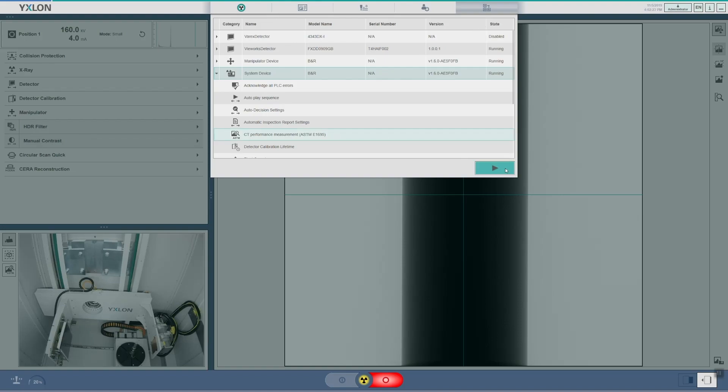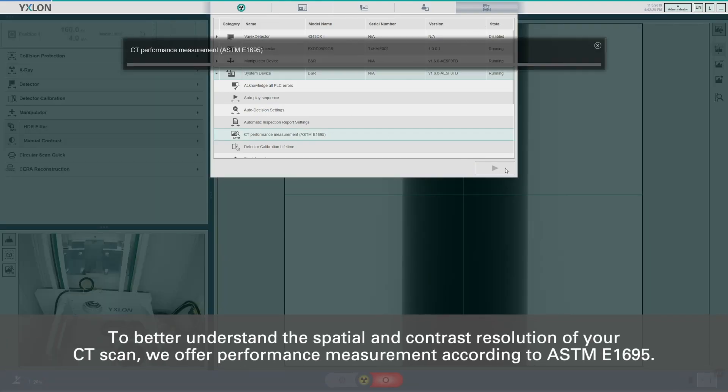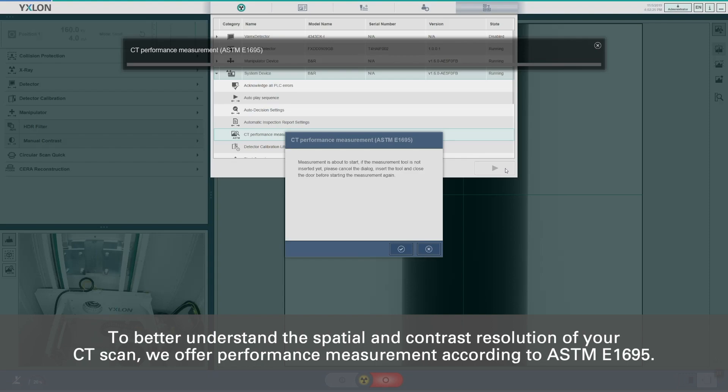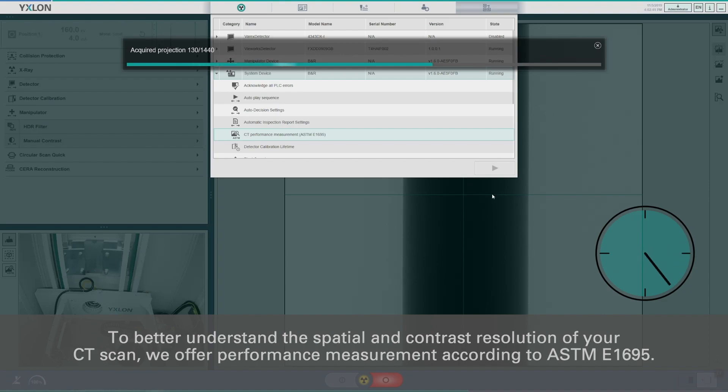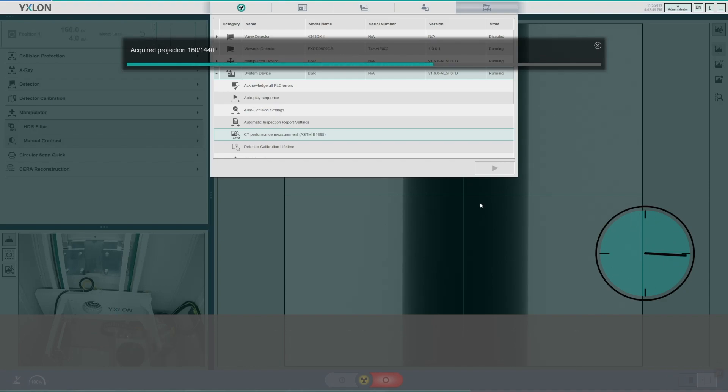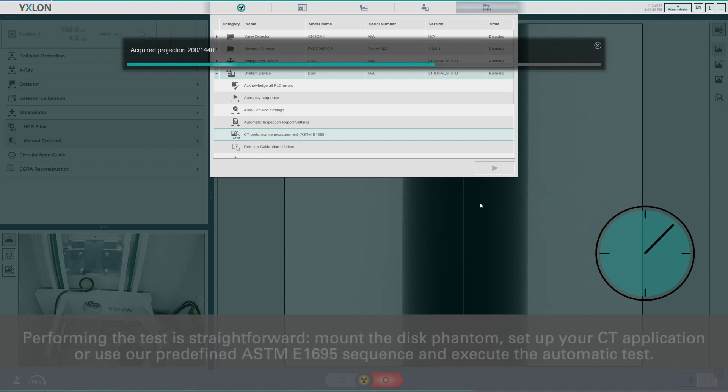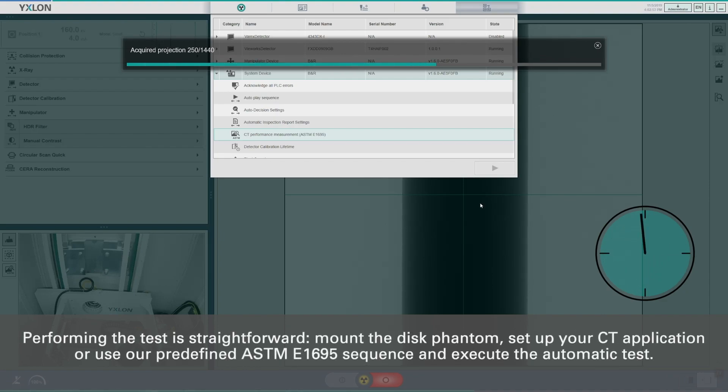To better understand the spatial and contrast resolution of your CT scan, we offer performance measurement according to ASTM E1695. Performing the test is straightforward.